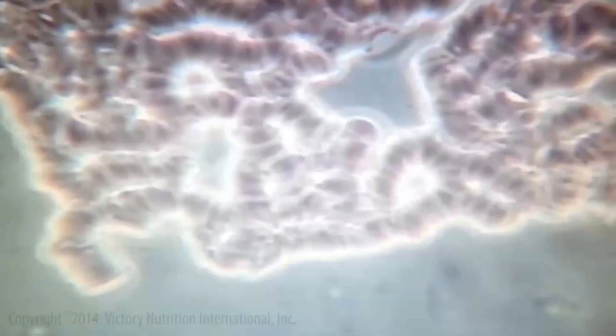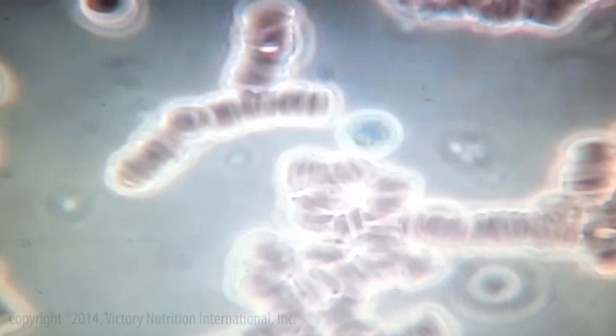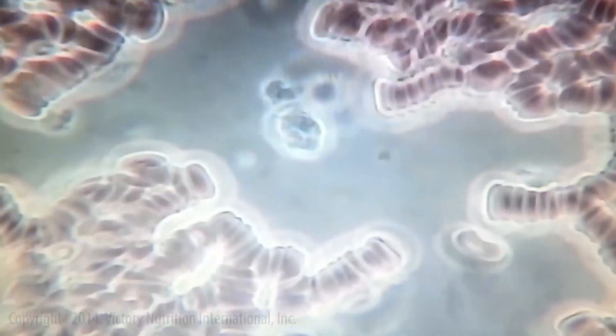This is a pretty good sample, but we seem to have a lot of cell aggregation. The red blood cells have lost their negative charge. This is a white blood cell — a neutrophil in particular — and it's about a quarter of the size it should be, probably because the cell aggregation is somehow affecting circulation and immune function. There's another neutrophil right there, and it should be twice as big.